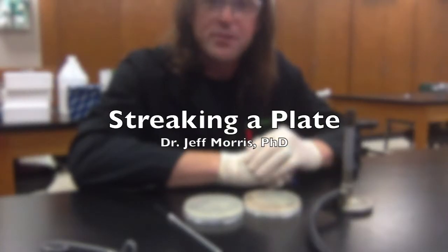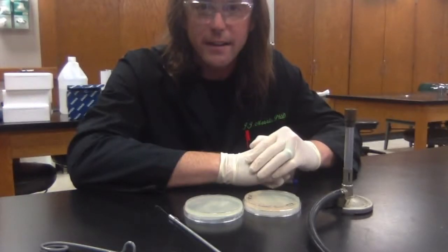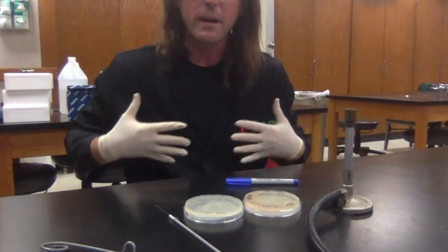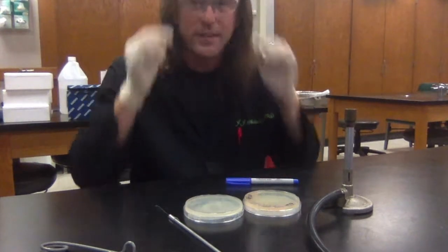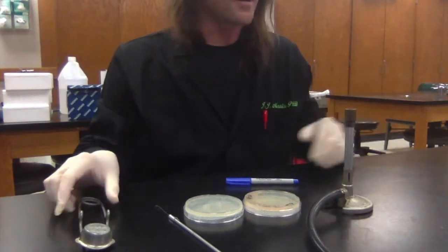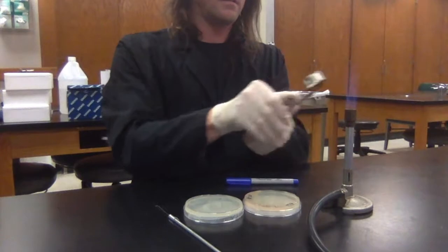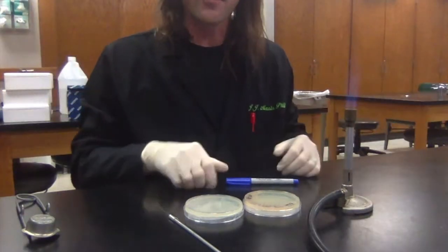I'm going to demonstrate how to streak a plate to get isolated colonies of bacteria. I've got all my personal protective equipment on — my lab coat, gloves, and safety glasses. I've also got a workspace set up with a Bunsen burner, which I'm going to light. Now I've got the Bunsen burner force field over my workspace.